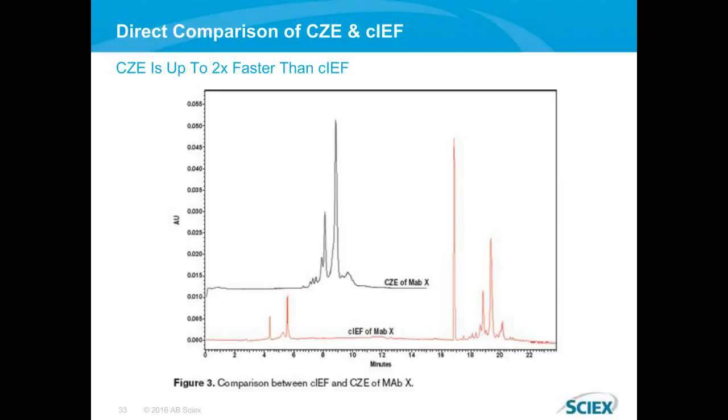So here's a direct comparison between our CZE and CIEF. Again, just to show you, you still get resolution for all three of your main peaks, the basic, the main, and the acidic peak. You get that charge heterogeneity information in, again, about 10 minutes here as opposed to close to 20 minutes for CIEF.